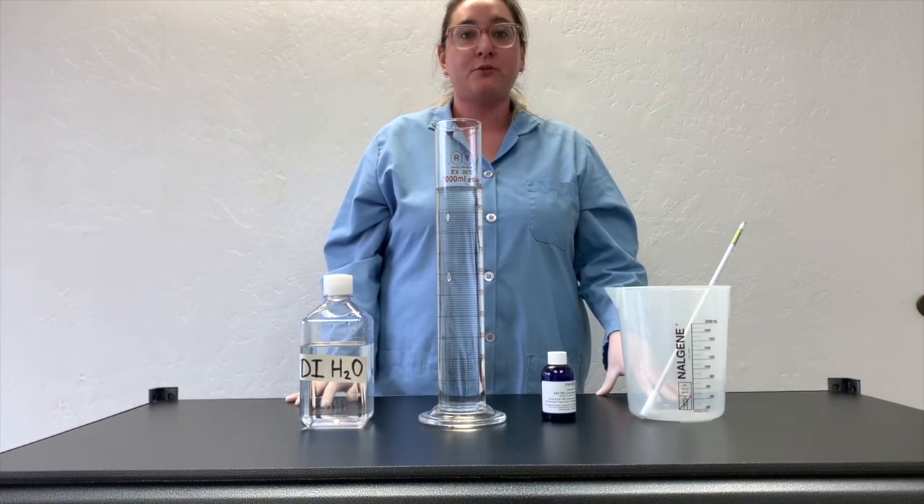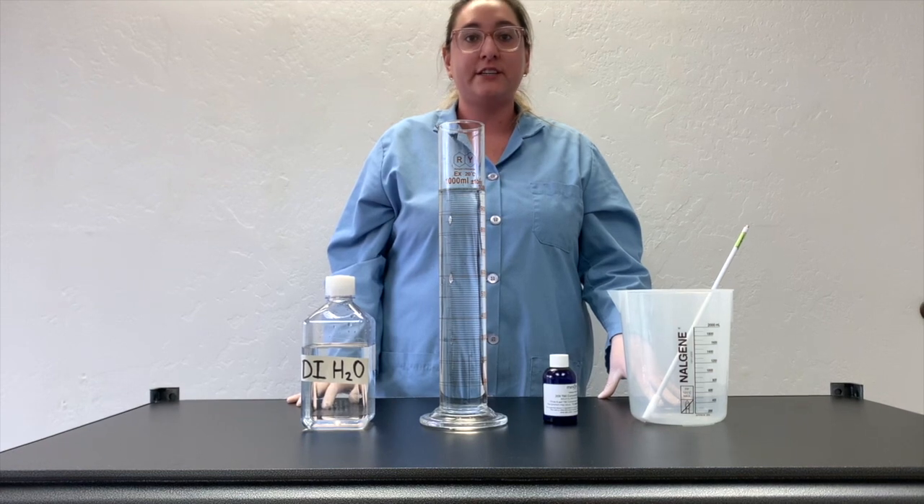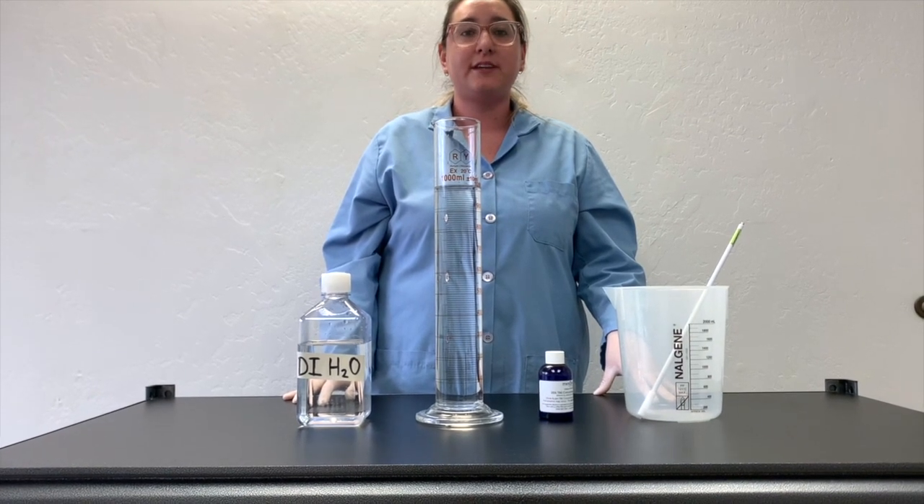Today we will be demonstrating how to dilute your 20x TBE buffer concentrate into two liters of 1x TBE running buffer.